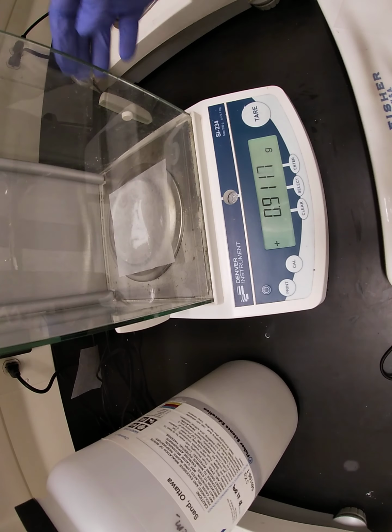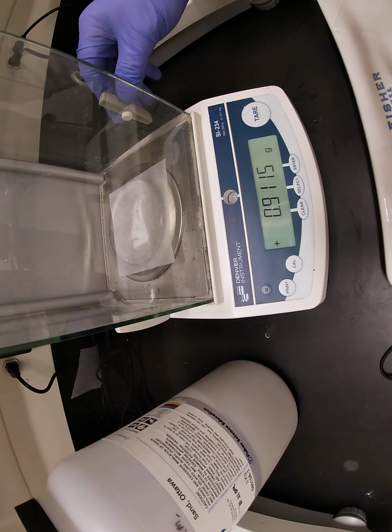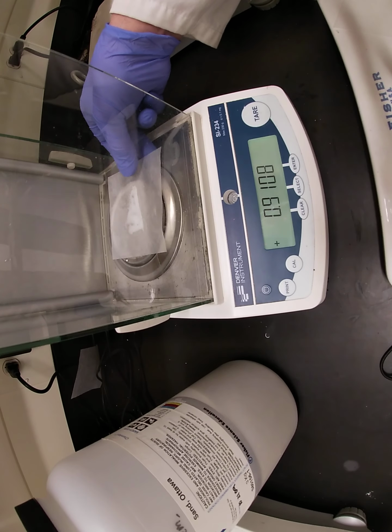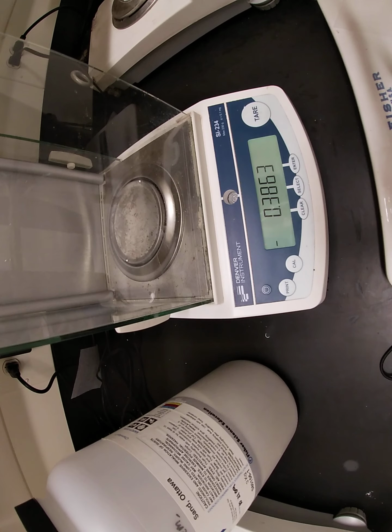We're actually going to call that one good. So it should stop bouncing, 0.9115. That particular ingredient you probably would know as ordinary table salt, sodium chloride, NaCl. And we're putting that into our beaker.